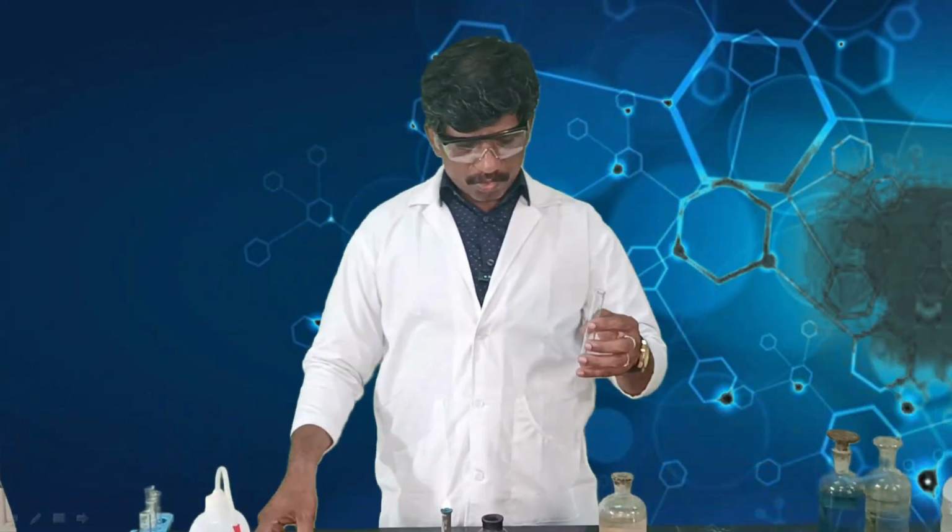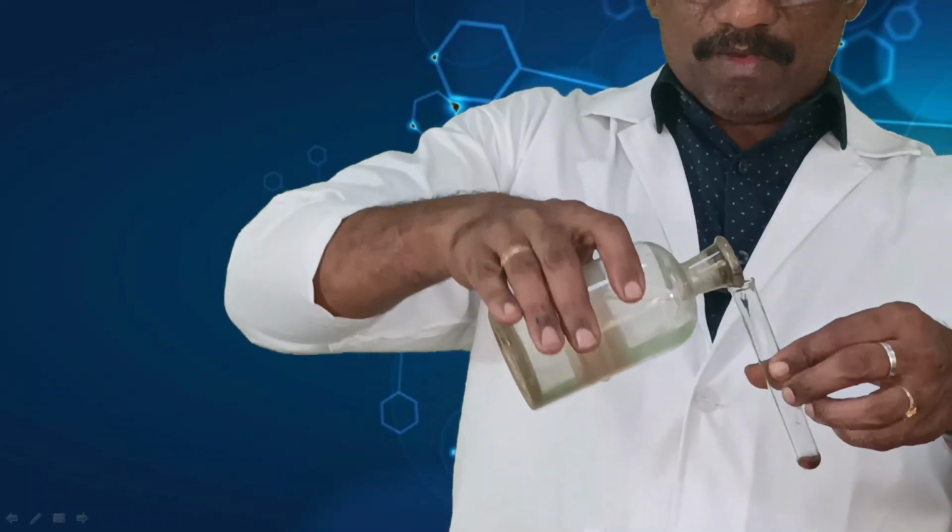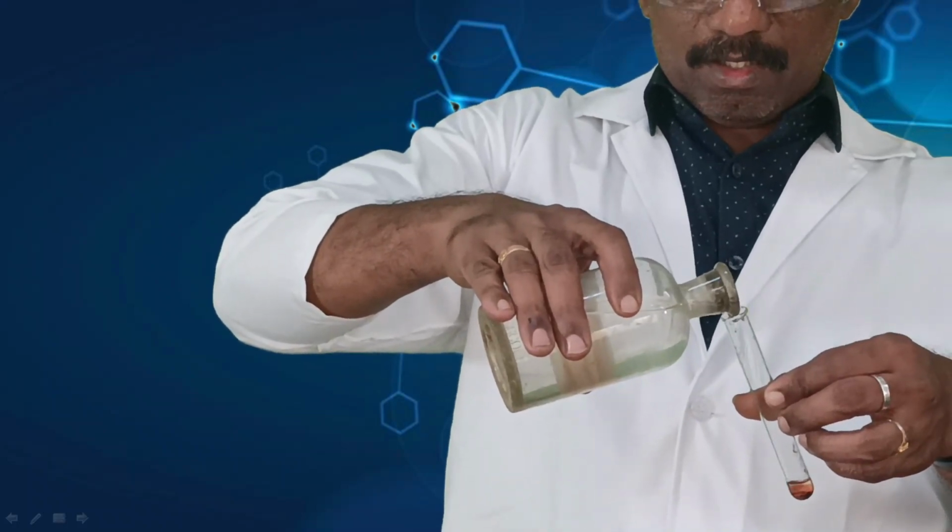I am taking alpha naphthol and dissolving it in alcohol. Okay, this solution is alcoholic alpha naphthol. Okay, now we shall continue the experiment.